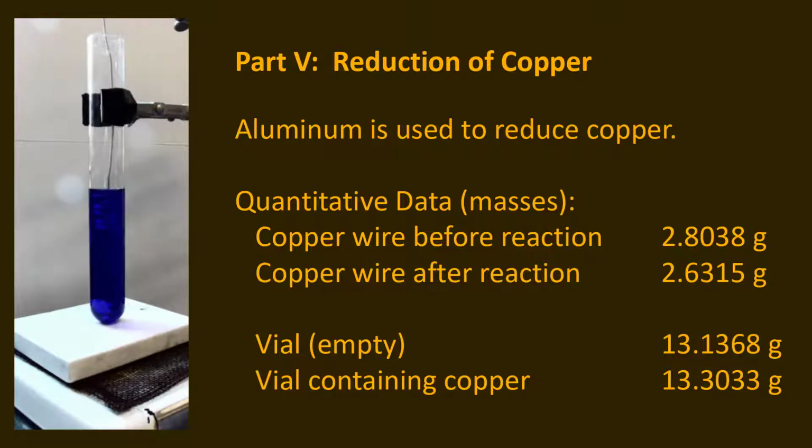That's kind of strange, because based upon what we know about single replacement reactions, you would expect this particular reaction to go pretty quickly. One of the things about all chemical reactions that we know is that they need to have both of their reacting components touch each other on a molecular level at each stage in order for the reaction to progress at any rate.